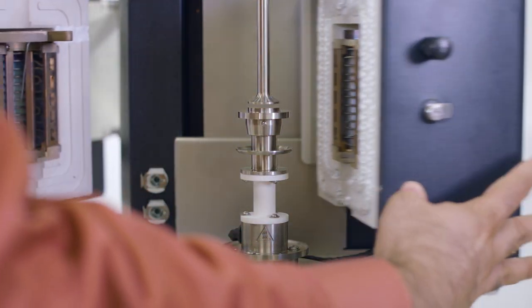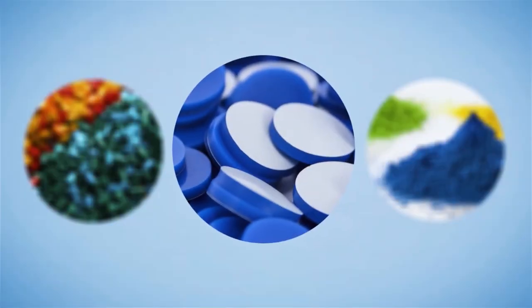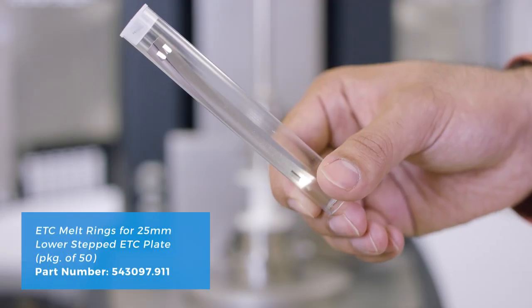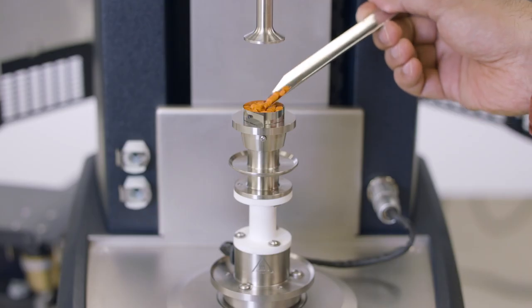Other plate sizes and temperature control systems can also be used for this application. If the polymer sample is already pre-molded in a disc form, then it is easy to load it directly onto the plate. In many cases though, polymer samples can be irregularly shaped, such as powders or pellets. We will therefore use a melt ring that will allow us to quickly and easily load these pellets onto the plate.